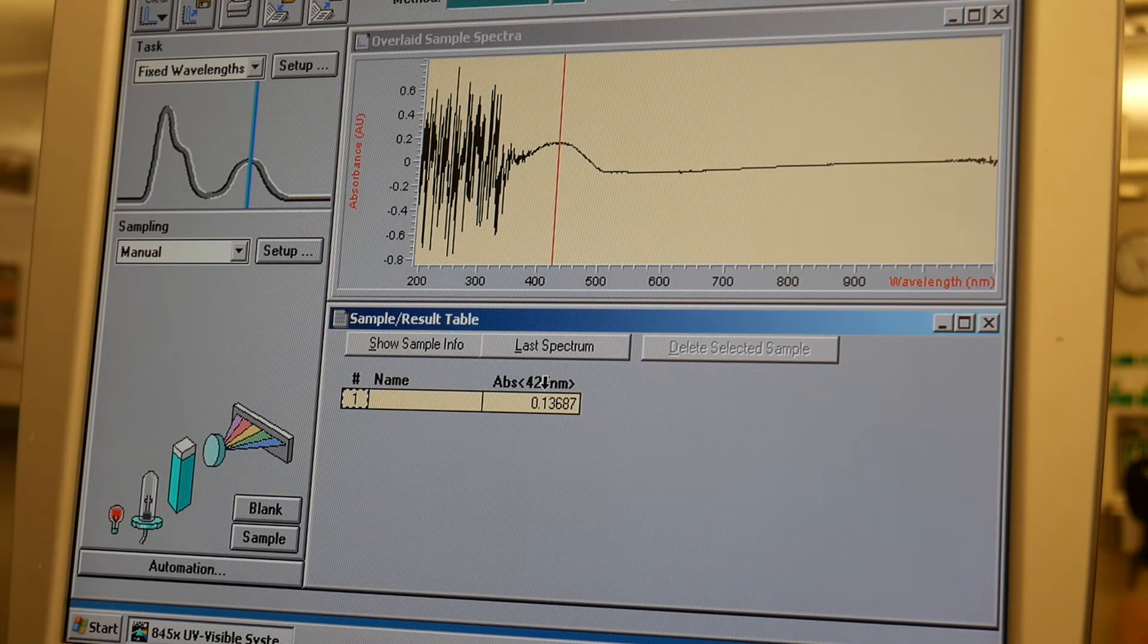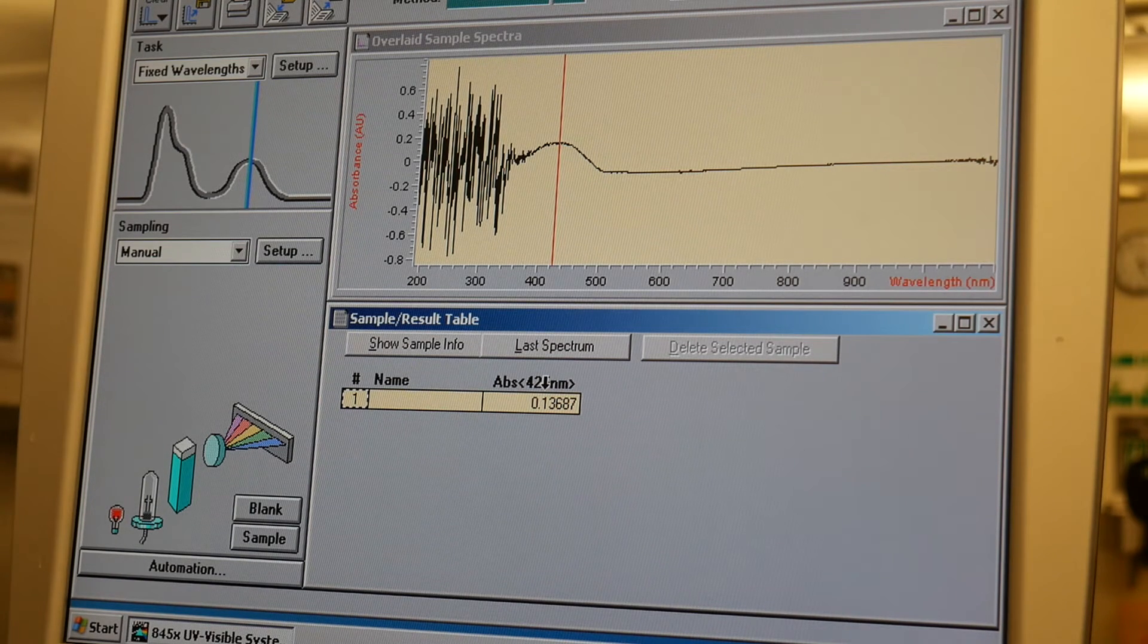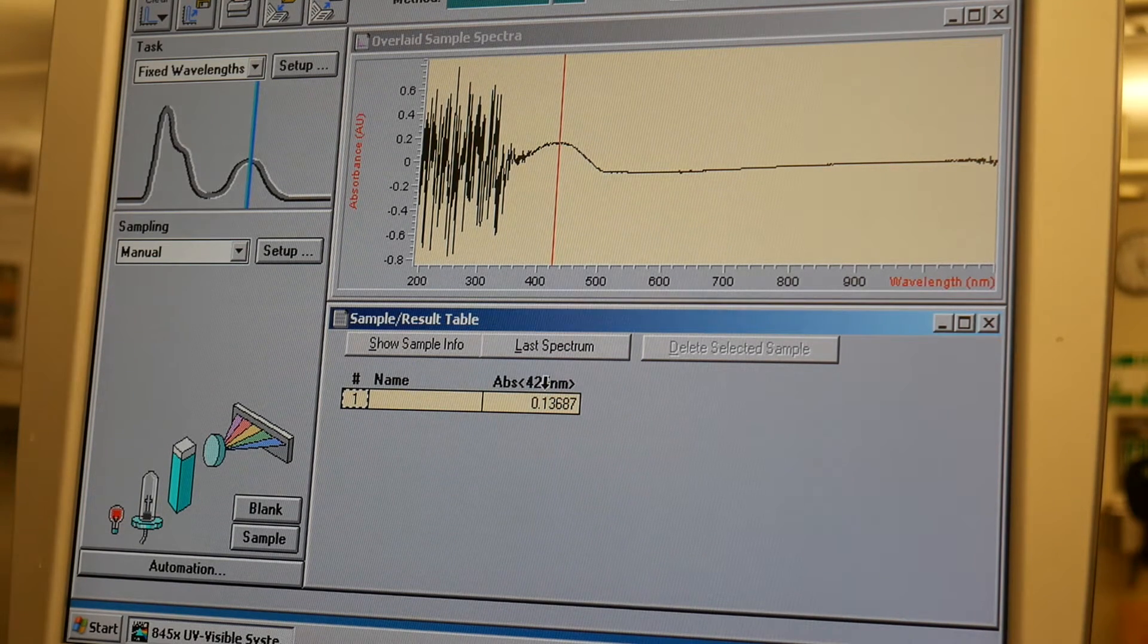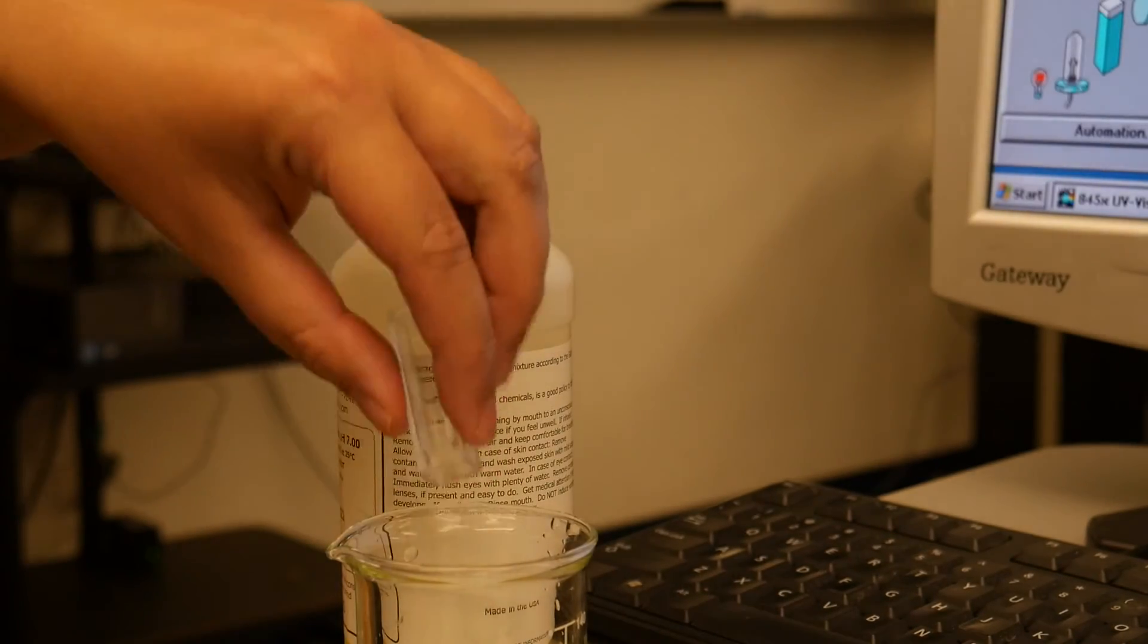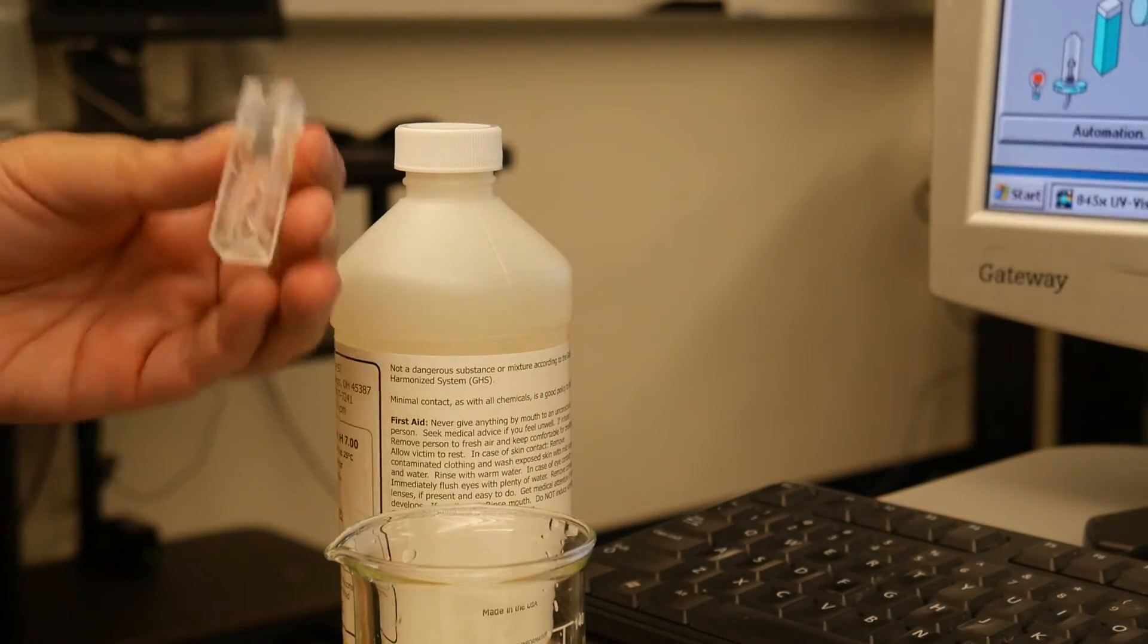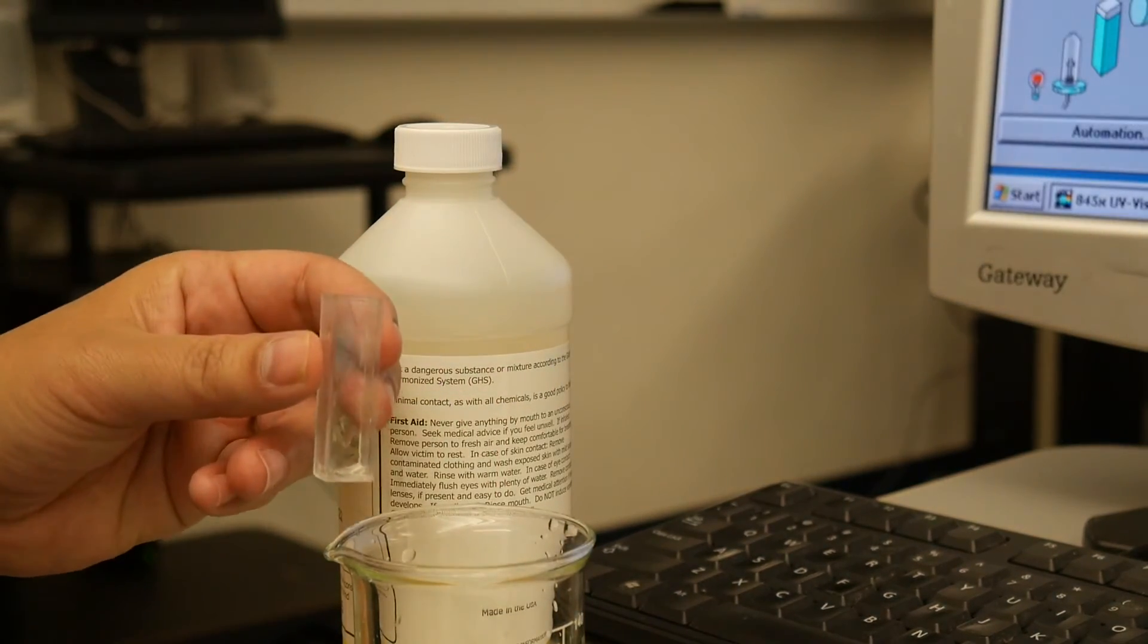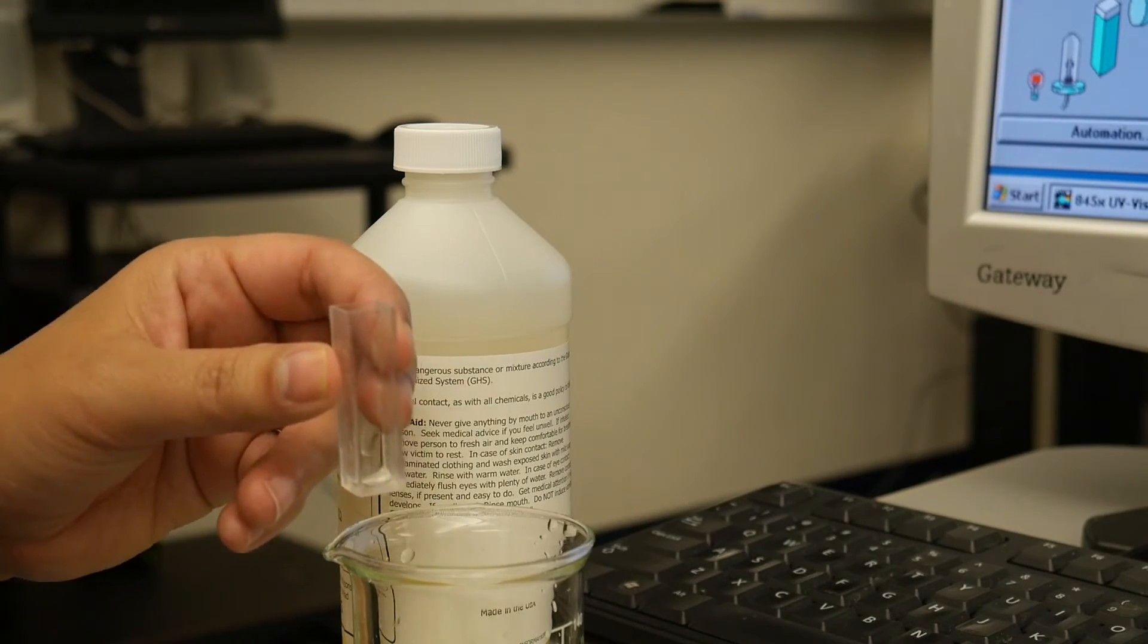So now you would repeat this with any other samples that you want to run, emptying your first sample into the waste beaker, rinsing the cuvette with the second solution, etc, etc.